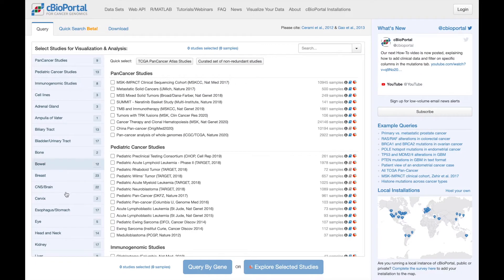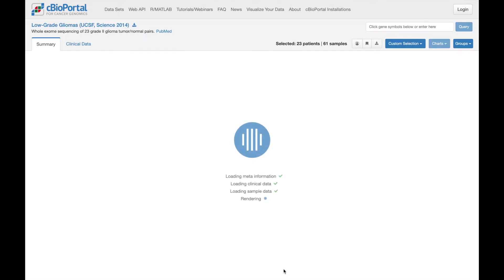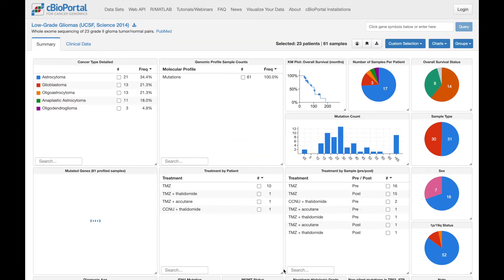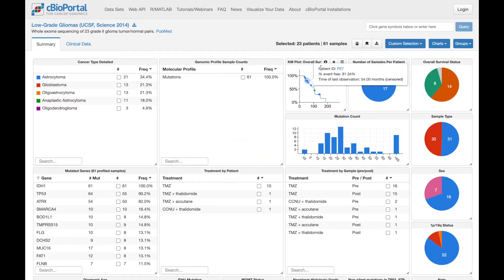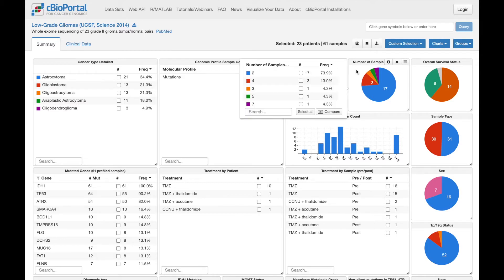For this video, we need to get to cBioportal's patient view, which we'll do by going to study view for this low-grade glioma study. Before continuing to patient view, which we can do here, I want to point out this chart, which shows the number of samples per patient. We can see that every patient in this cohort has multiple samples profiled.